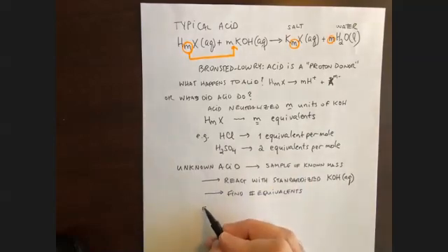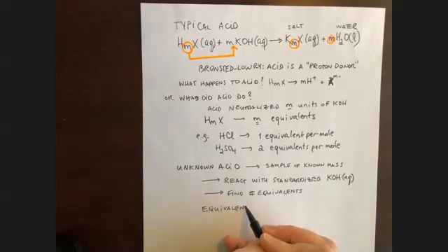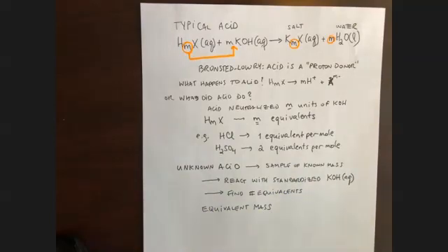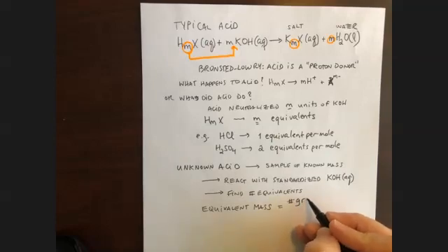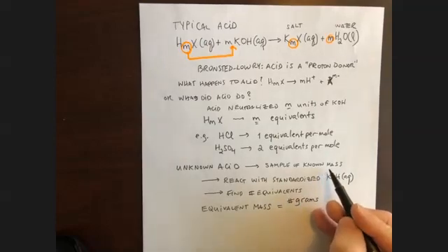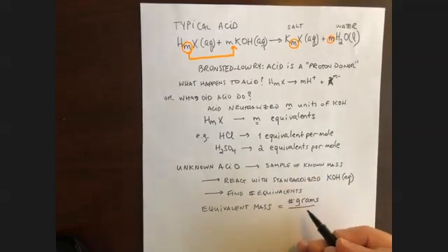And so we can determine something called the equivalent mass, sometimes called the equivalent weight also, because here in America, we sometimes use those interchangeably, as the number of grams, because we know what that is from our sample measurement, divided by the number of equivalents.